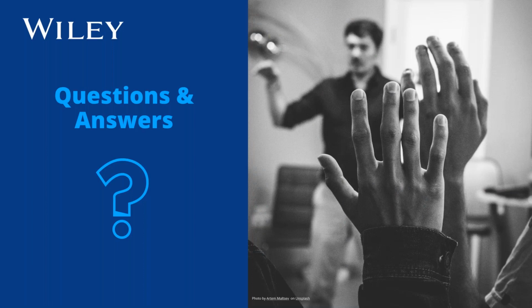I know that in future versions of the software, we do plan to add more methods. Michelle or Nadia, do you happen to know what methods we're planning to add in the near future? LCMS, Nadia? LCMS. HPLC, we keep an eye on that.